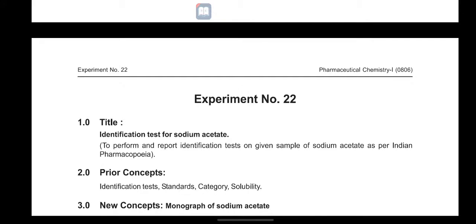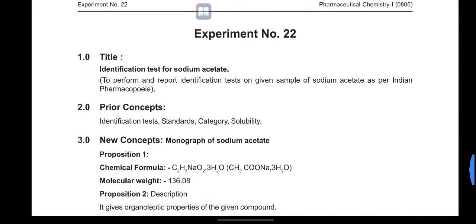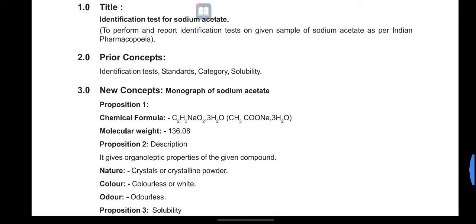Welcome student. Our next experiment is experiment number 22: identification test for sodium acetate. The aim is to perform and report identification tests on the given sample of sodium acetate as per the Indian Pharmacopoeia.